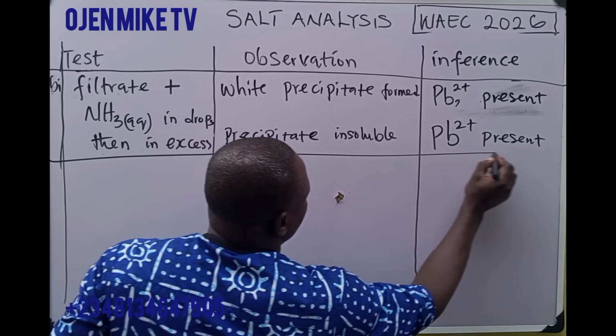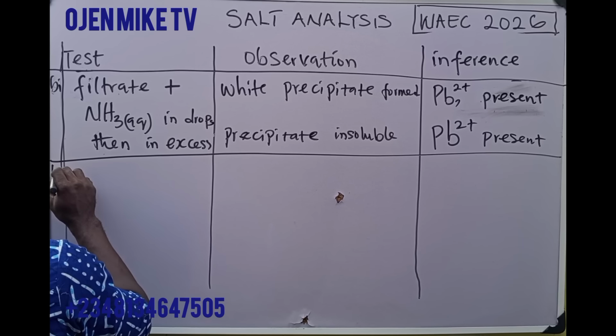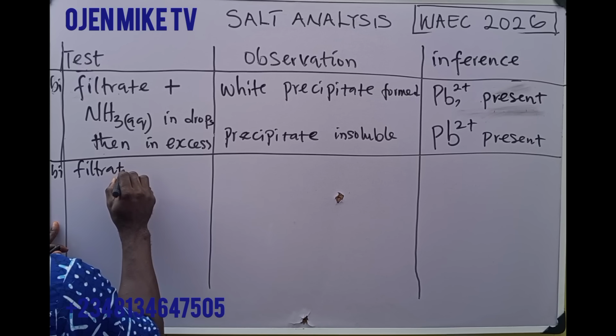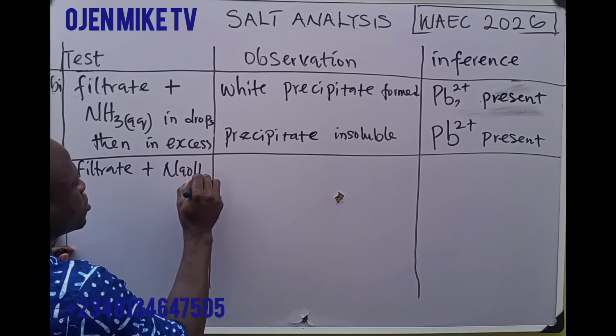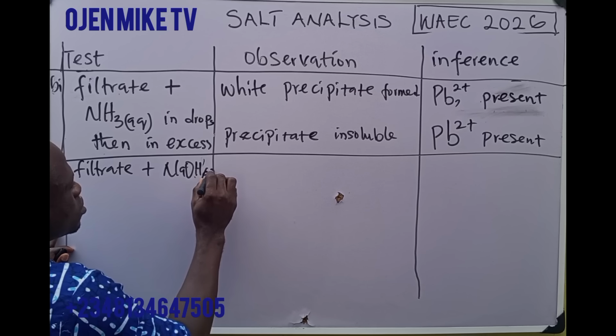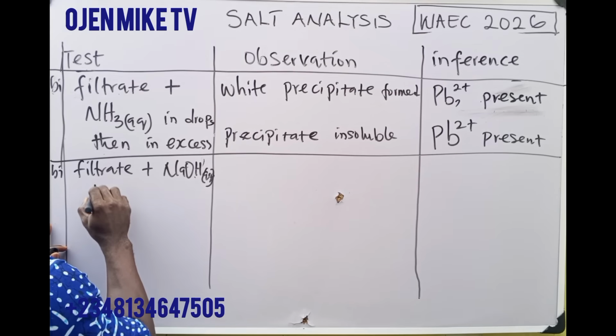We roll our line. It is either you are asked to use this one or you say Bi filtrate plus aqueous sodium hydroxide in drops.